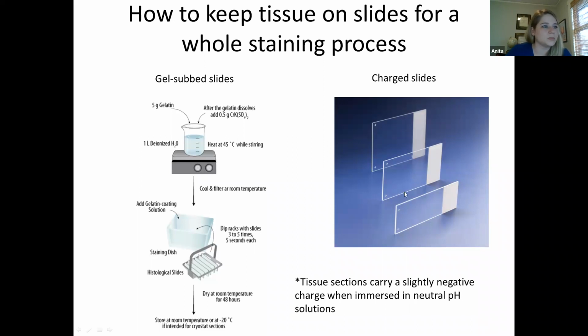In this case, these are Superfrost Plus slides, but there are other brands. I'm not paid by Fisher or anybody. The tissue sections carry a slightly negative charge when they're immersed in neutral pH. So having the positively charged slides will help your tissue stick to the slides. So if your tissue's falling off, ask yourself, did I gel sub my slides? Probably not, because only people did that 20 years ago. I should be buying charged slides.